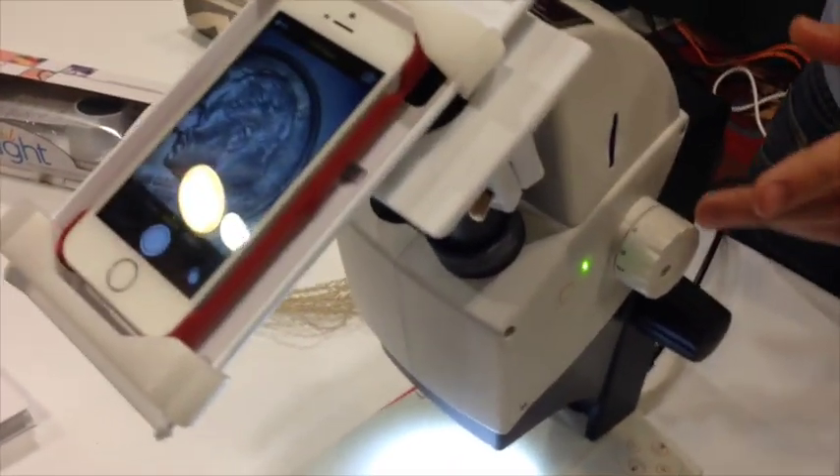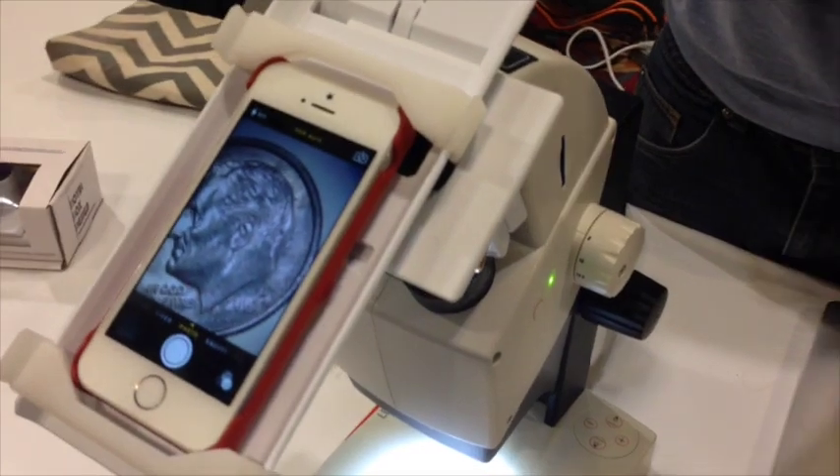This is a universal smartphone-to-microscope adapter. Digital microscopes cost thousands of dollars, and cameras that you attach to your microscope can cost hundreds to thousands of dollars. So what we offer is a simple device that costs much less to affordably upgrade a microscope you already have in the classroom to a digital microscope. You can save your images, manipulate your images, and even take video. You can share one microscope with a group of students, and they can engage with it using their cell phone, take pictures home to do homework, and have digital lesson plans — all at very low cost.